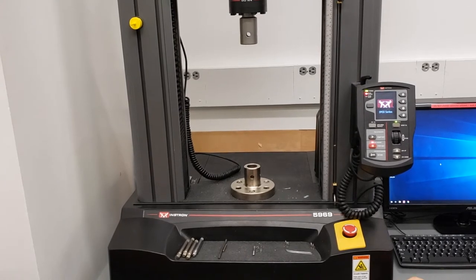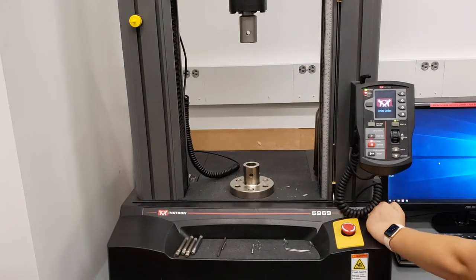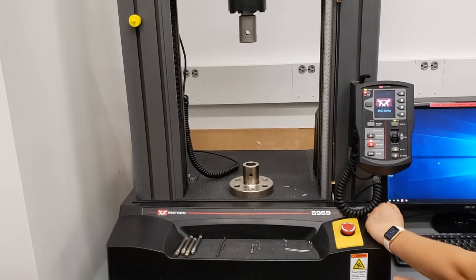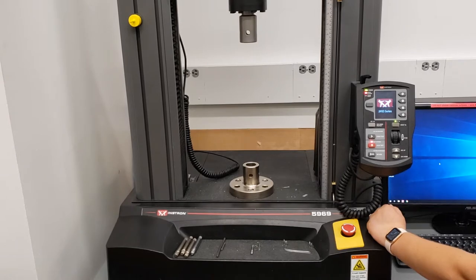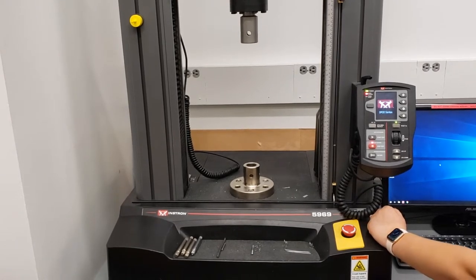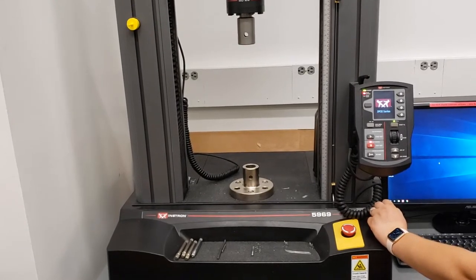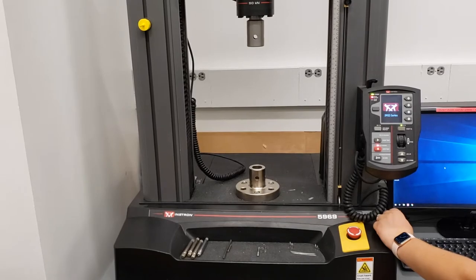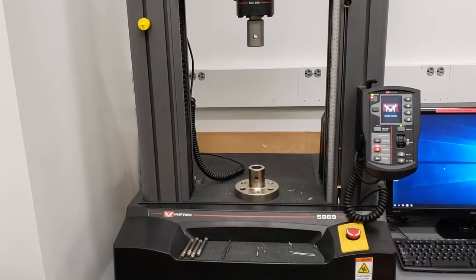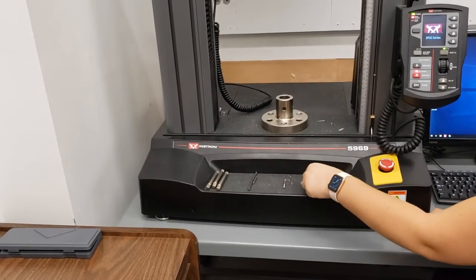Also on the machine here, we've got these two holes — that's where we're going to attach our fixtures. Instron is very friendly as far as fixtures. You can attach pretty much anything that fits well in there. You want to make sure that your fixture is rated higher than your sample. For example, if your sample breaks at 1000 Newtons, you want to make sure that your fixture does not break at 500 Newtons. All of the fixtures attach using these clevis pins and clevis clips.